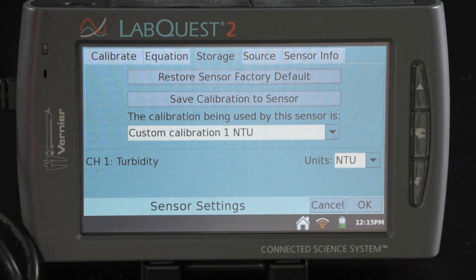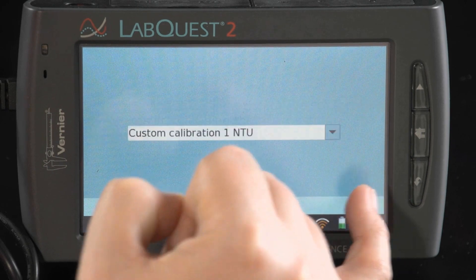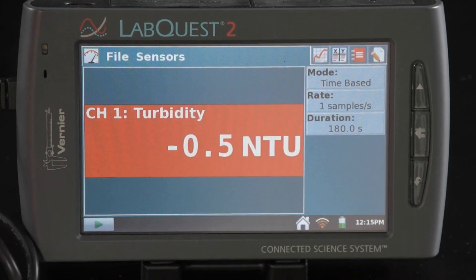This measurement is often done in a field environment, so it's recommended that you perform calibration in the classroom or lab before you go into the field. You can then store your calibration to the sensor itself so that the calibration is remembered when you go out into the field. To do that, on the same calibration screen, select 'Storage,' then 'Save Calibration to Sensor,' select OK, and then select OK again. That calibration will be remembered with that sensor so you don't have to redo it in the field.